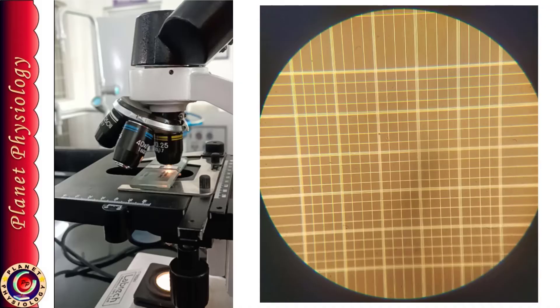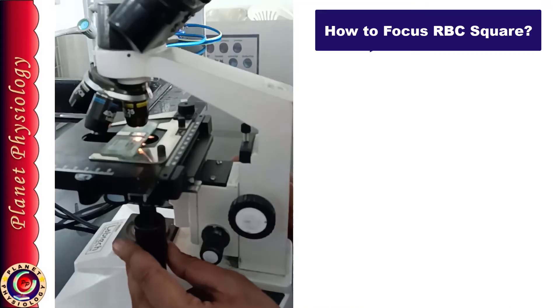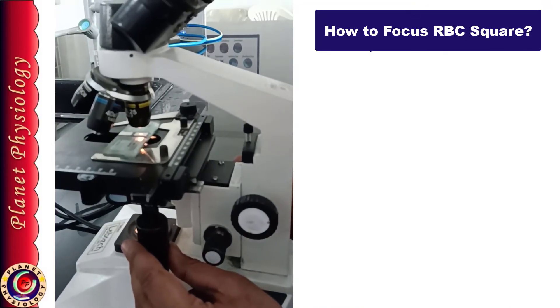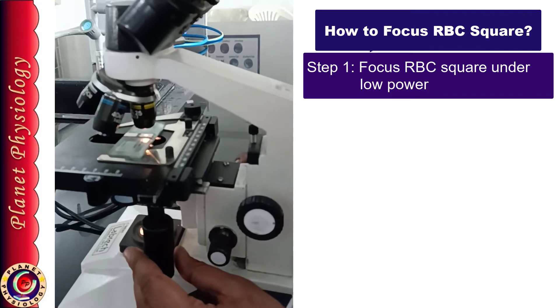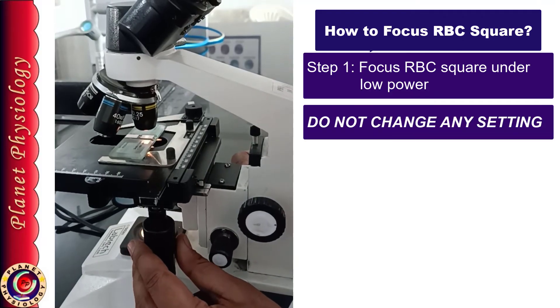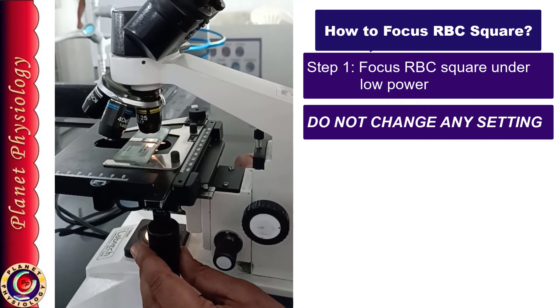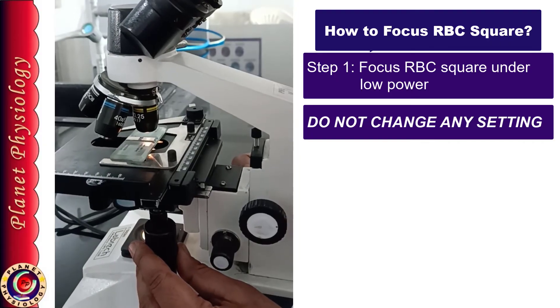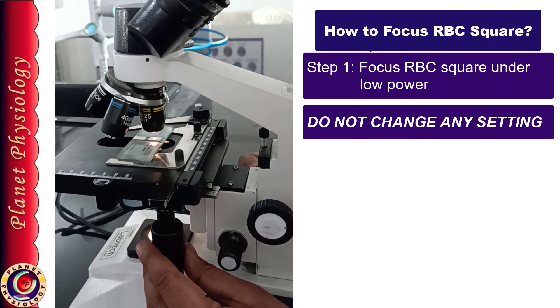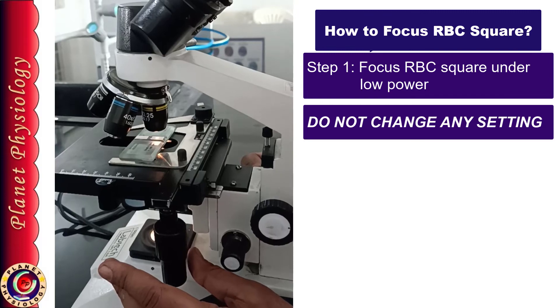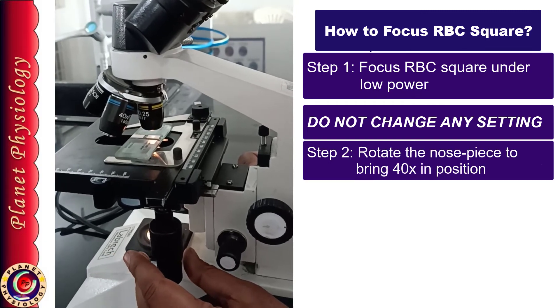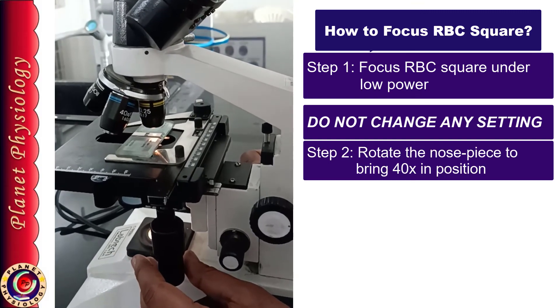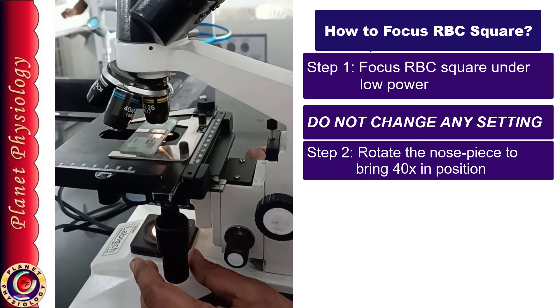This is not to be done. So let us see how is it done ideally. It is job of just few seconds. So once you have focused central RBC square, do not change any setting of the microscope.